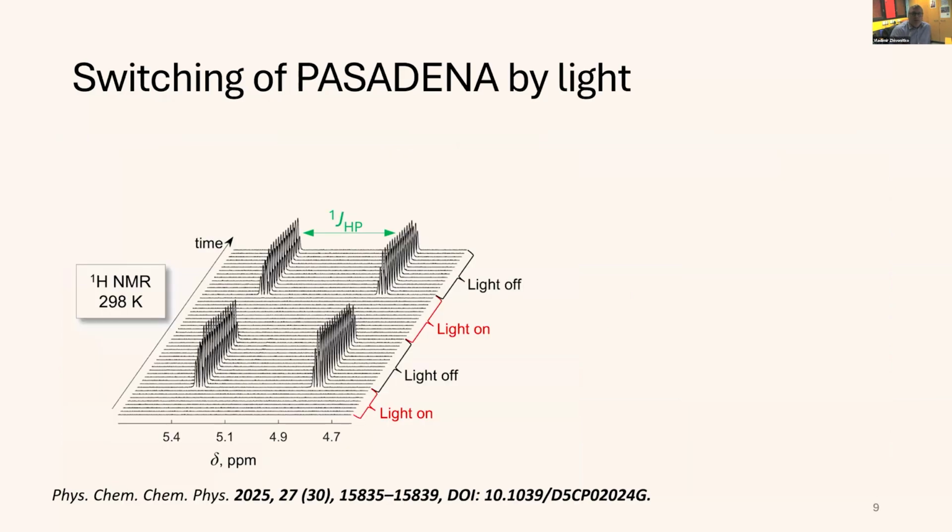After the sample preparation, we observed a clear response to light in the proton NMR spectra. Light on periods, as it is shown here for one of the protons in the adduct of the biradicaloid with parahydrogen. So during light on periods, we do not observe any signal enhancement, and during light off events, we observe strong NMR signal enhancement. By the way, the absolute mode spectra are plotted here as a function of time, but normally the signals are antiphase, as I showed a couple of slides before.